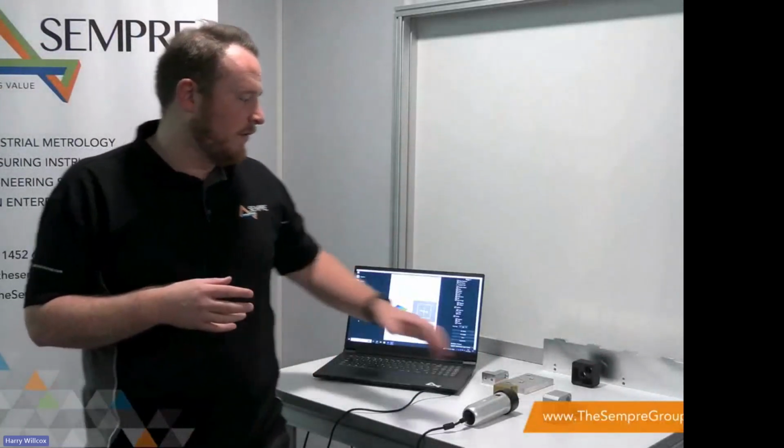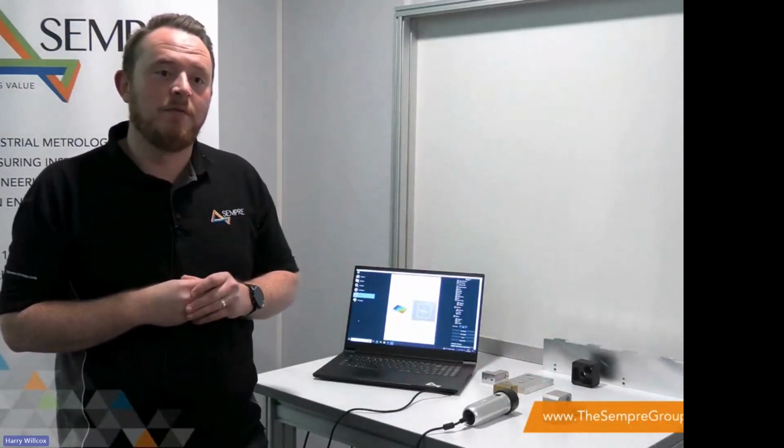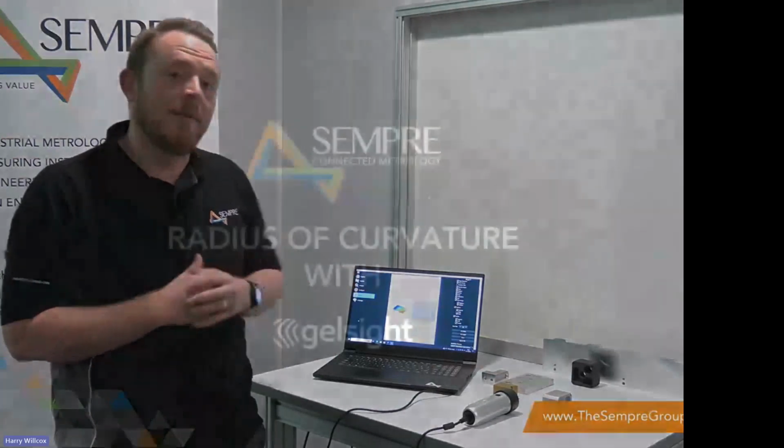So I can save that onto a network or export it, print it out, stick it to a tracker sheet for the defective part. But it's a really good example of how I've gone from there's a defect on my sample within a specific area that I need to tolerate or understand. Within 3 clicks, I've got a report of a traceable set of information that we can use to understand a little bit more about that.